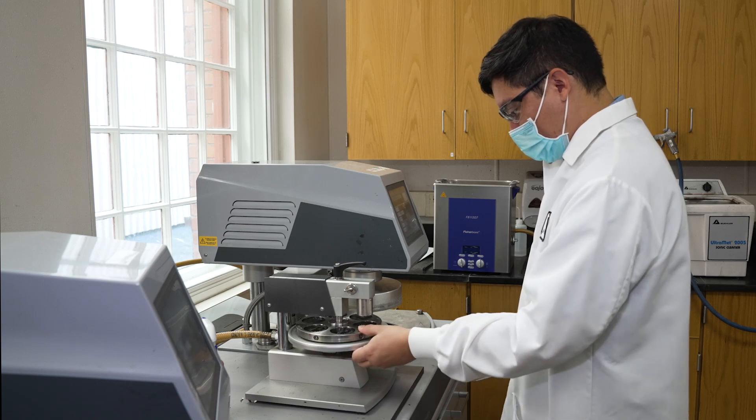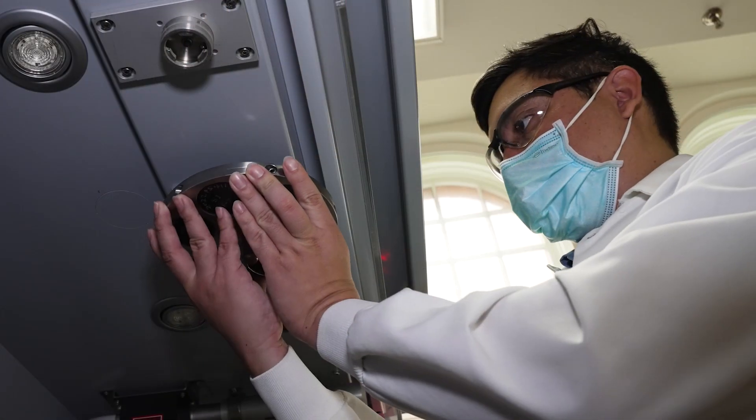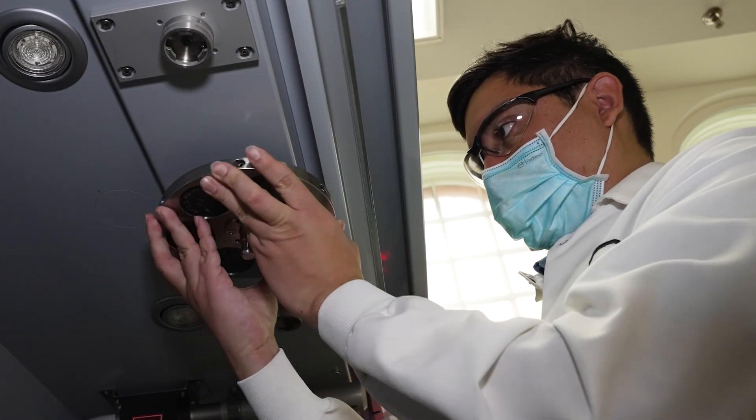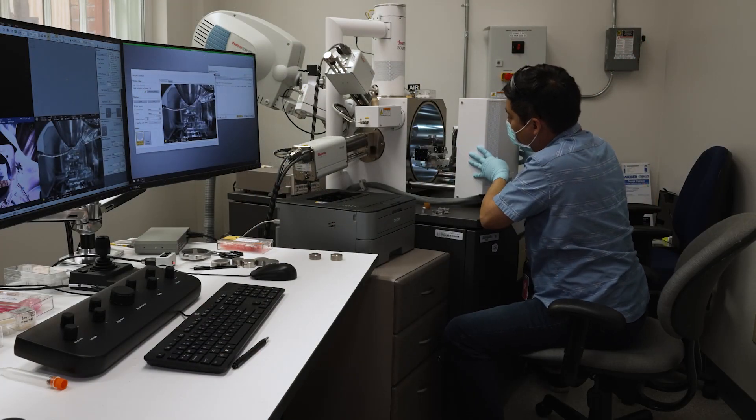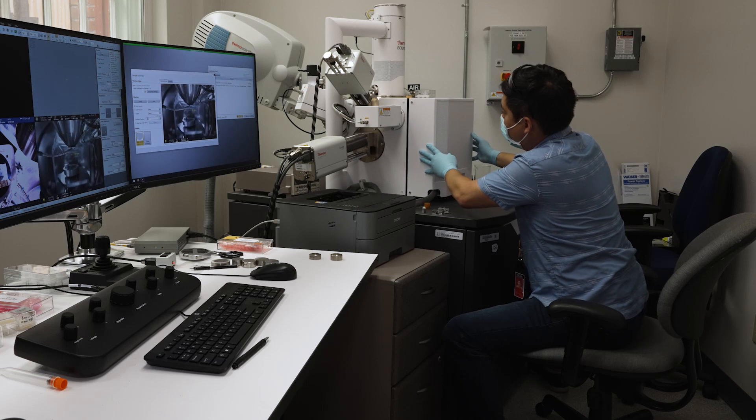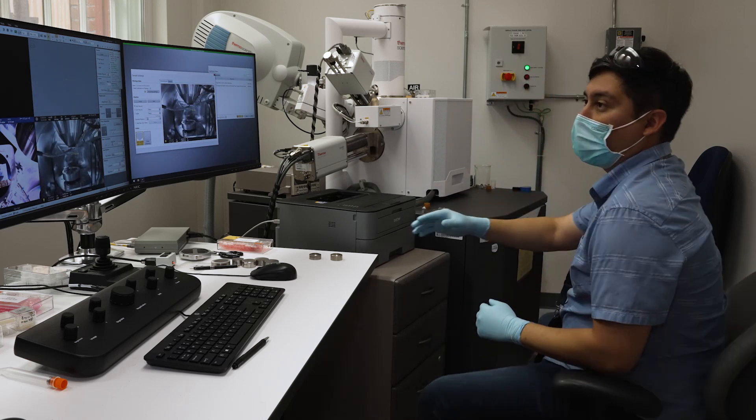Welding samples are cross-sectioned and polished to inspect for defects like voids, cracks and oxides. We also provide failure analysis services, not only on metal components but polymer and ceramic samples as well.